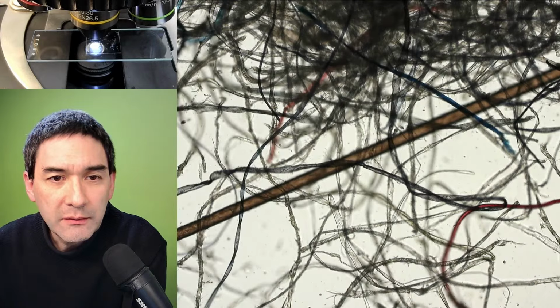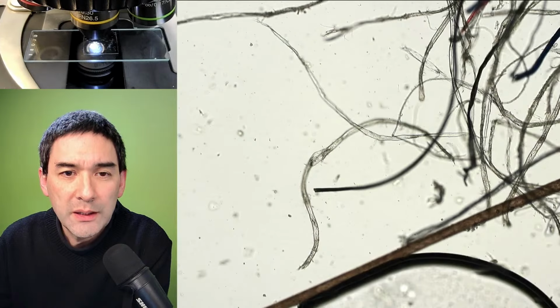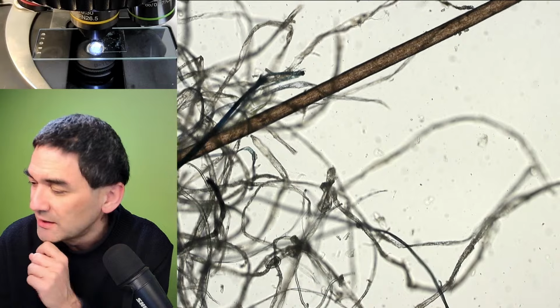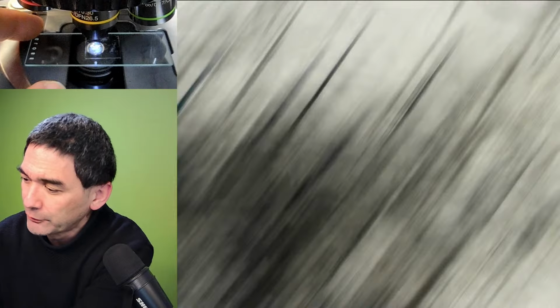When you're looking at fibers, what I sometimes see is that there can also be hair in there, of course. What I would do next is show you a couple of other samples that I've got.